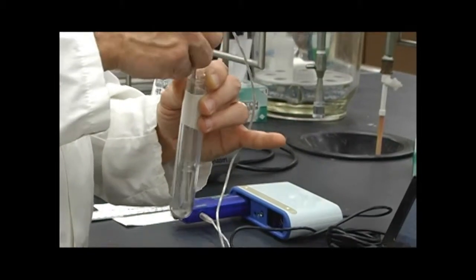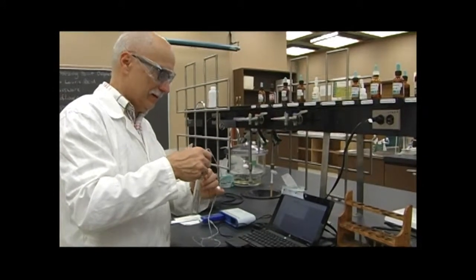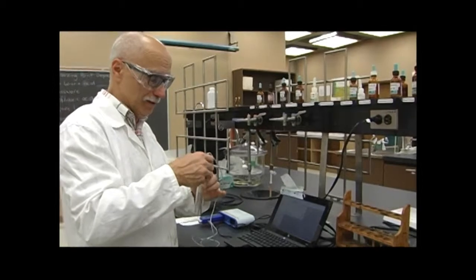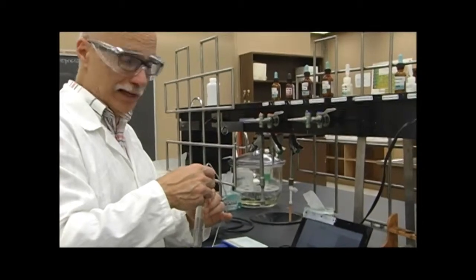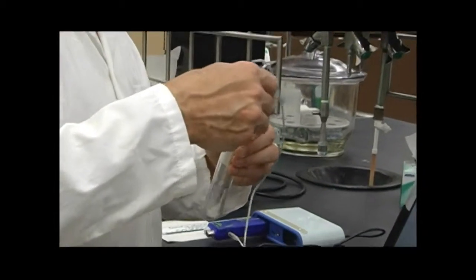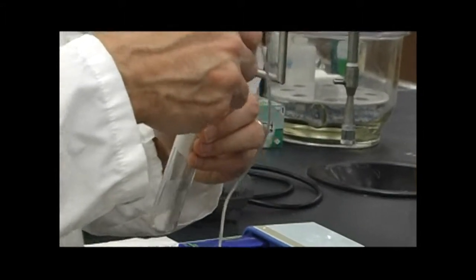May be tedious, but it's a neat experiment, people. I guess the question is, can we raise the melting or the freezing point? And I guess talking about freezing point depression tells us we can't get freezing point elevation. We're down to 39.7.